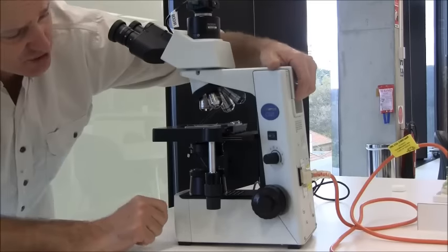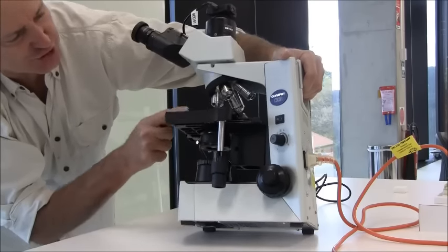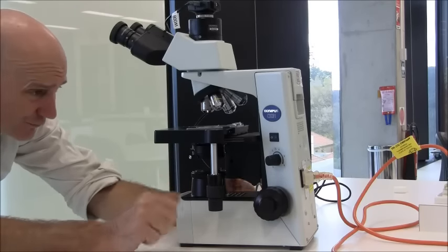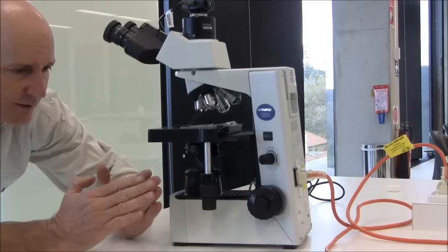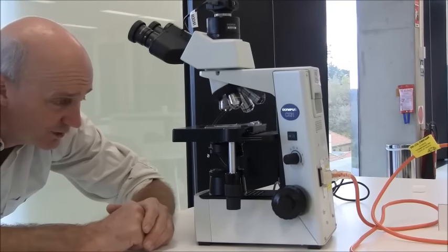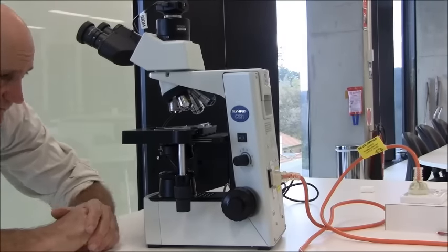The condenser, as I mentioned, is this series of lenses, and its job is to take the light from the light source and actually focus it into a sharp point onto your specimen. And this can make a lot of difference in getting the image sharp. A poorly focused condenser will give you a poor image. And so focusing the condenser goes like this.